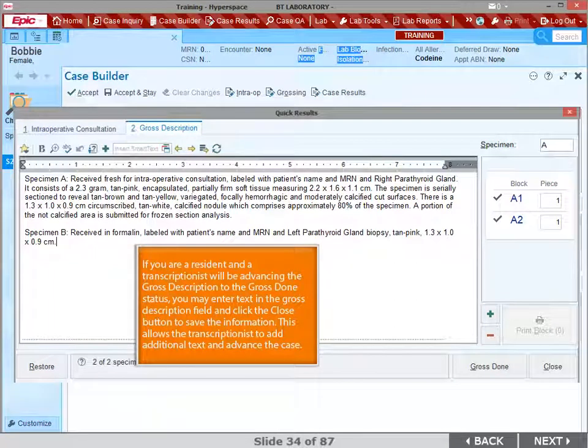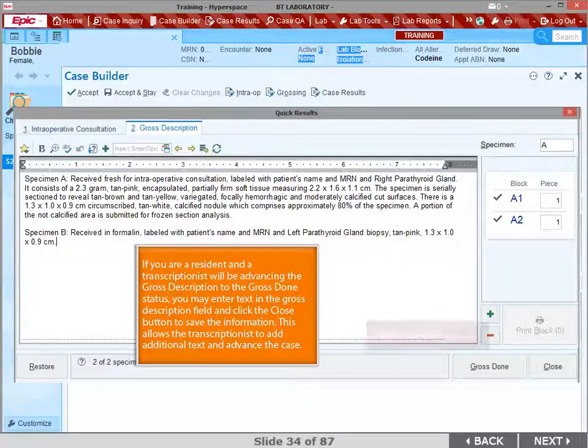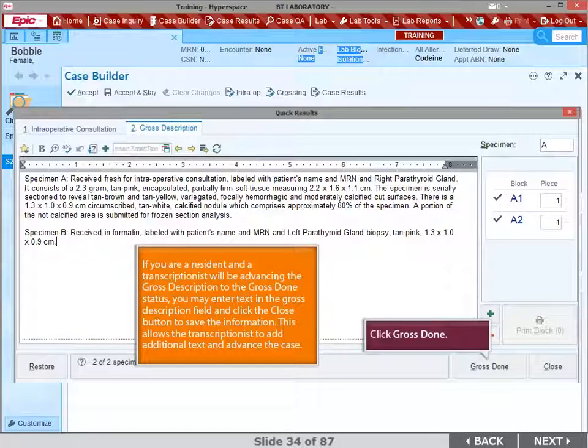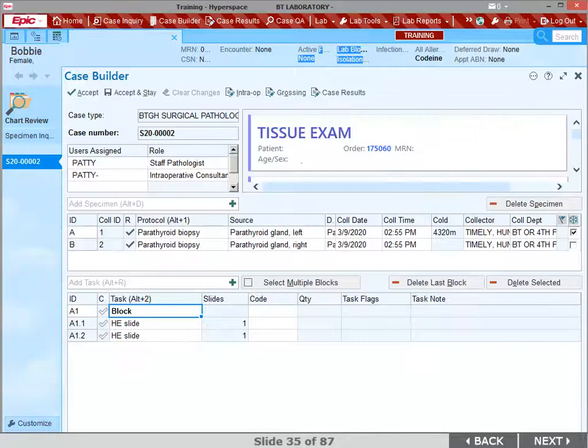If you are a resident and a transcriptionist will be advancing the gross description to a gross done status, enter text into the description field and click close to save this information. This allows the transcriptionist to add additional text and advance the case. For this example, you are adding the gross and advancing the case to gross done. Click Gross Done.